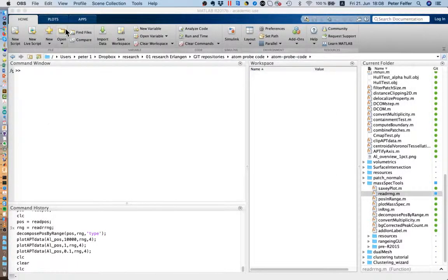Hi everyone, I haven't done a video in a while, so I just wanted to do a video again, essentially because I've moved my code repository and there is some code that might be very interesting for you guys out there as well.